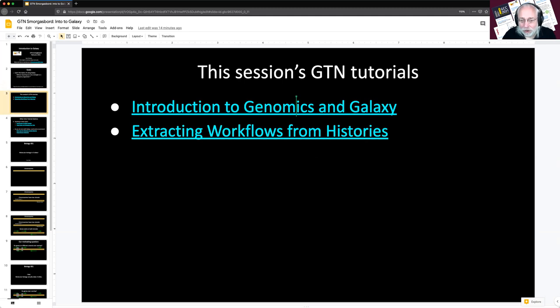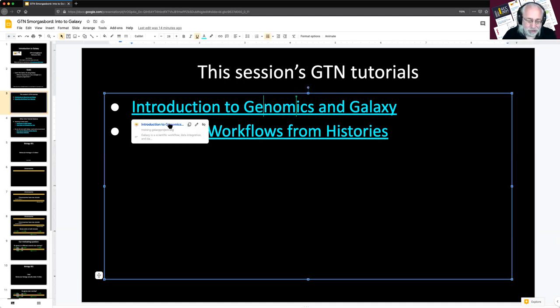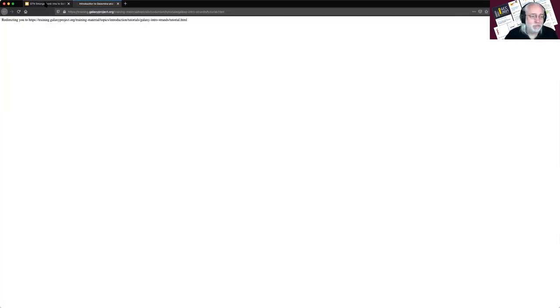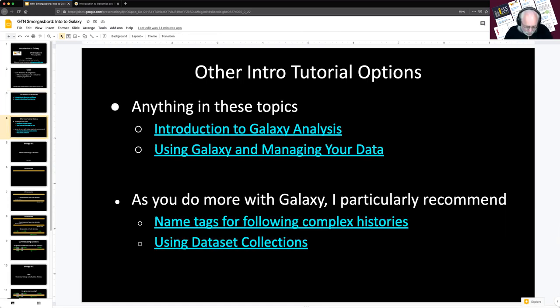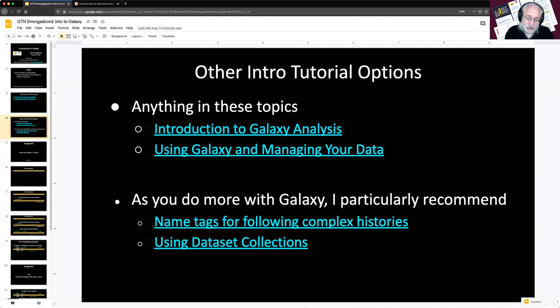This session's tutorials are introduction to genomics in Galaxy, and about two-thirds of the way through we'll make a slight dip into extracting workflows from histories. Those are the two tutorials we'll be walking through today. There are lots of other intro tutorial options in the GTN, which is grouped by topic. The two introductory ones are Introduction to Galaxy Analysis and Using Galaxy and Managing Your Data.